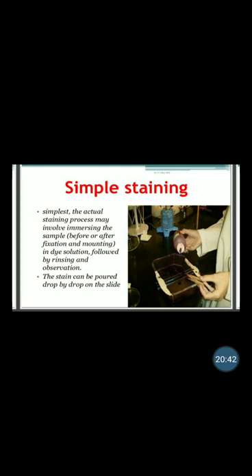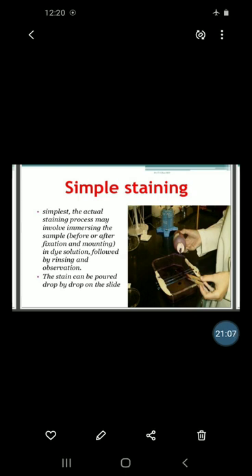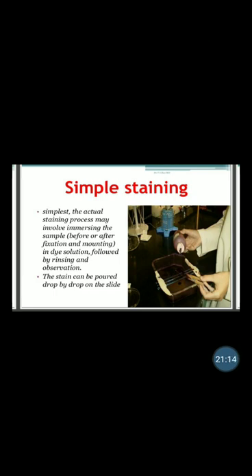Keep in mind, the stain is added, poured or floated on the slide in a drop-wise manner. This is simple staining. This is all about simple staining. We will see the next staining technique in the next lecture. I will stop here.